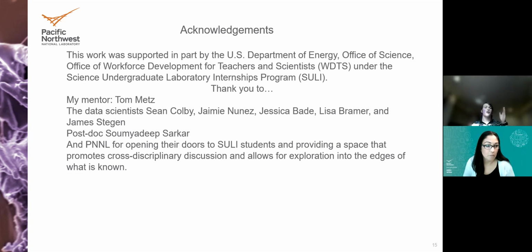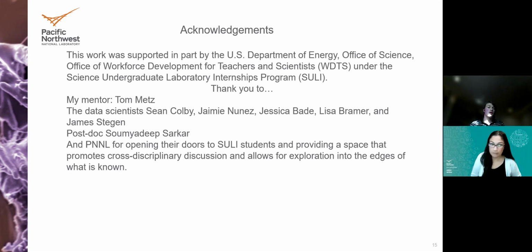So as we slowly go through a gradient, it's like a 10-minute process. So it's a continuous gradient solvent. So over the course of 10 minutes, we have different compounds coming off. And so retention time allows us to see, okay, we see the compound coming off at say 5 minutes. So we know this is a more polar compound than non-polar compound because the solution is becoming increasingly polar. So it allows us to separate via polarity. And while it's not necessarily a standardized value across laboratories, what it allows us to do is, if compounds do have similar molecular formulas, we can separate them by their chemical properties.